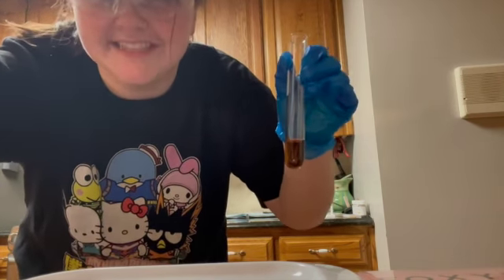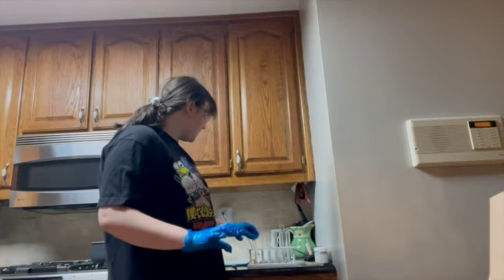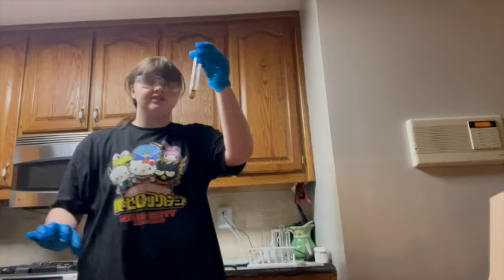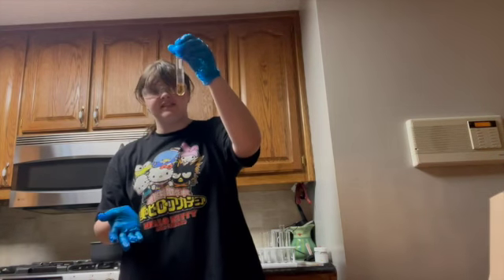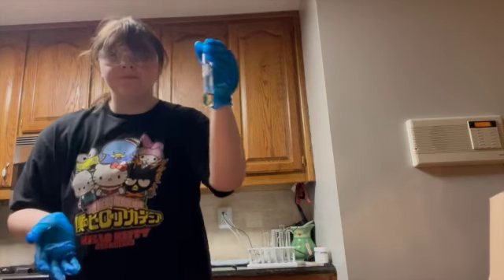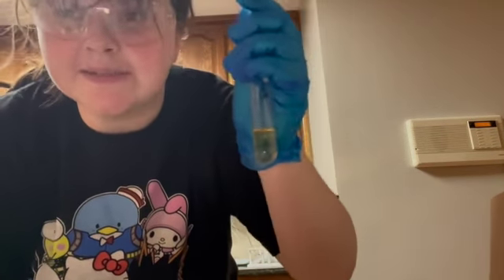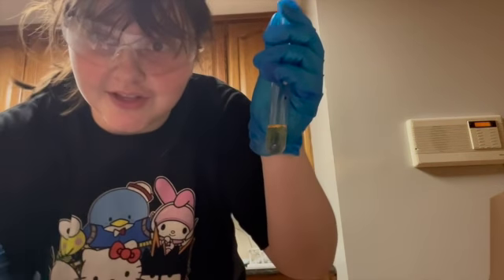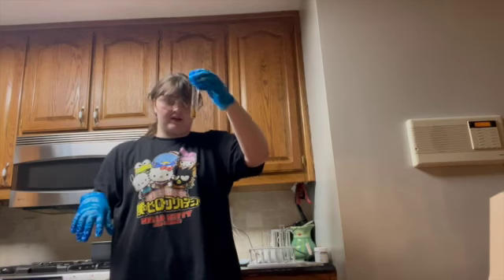Okay, so we've reached the 15-minute mark, and the solution is looking a lot more yellow than it did before. It's always been clear, but it seems like it's getting closer to that colorless clear state than we were just a little while ago.